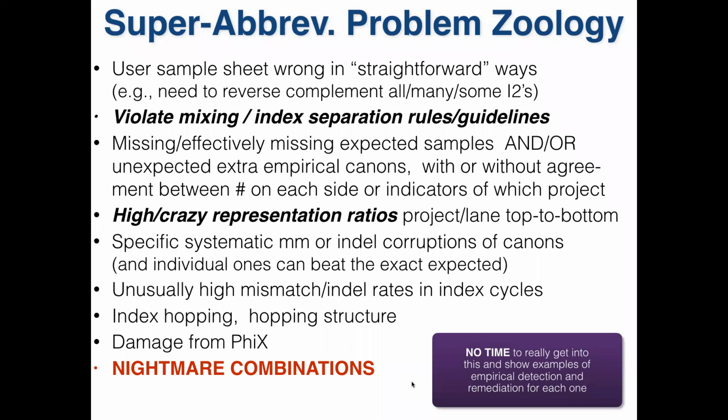We saw cases on the first day where like 30% of the representation can be lost. But the example I think we used to have was the variant where the expected one was still the top one, and then a little bit lower down, 5 variant guys, but he was still below. So you can get cases where the top sequence for a guy is actually what looks like a problem.